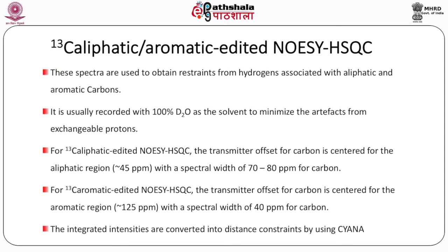Therefore, when you put D2O in the sample, you actually lyophilize the sample and rehydrate it with 100% D2O or 100% D2O buffer. Then what happens is that the amide NH get exchanged, and so they do not give any spurious peaks in the spectrum, so that the spectral width can be shortened and one can only look for the CH aliphatic region or the CH aliphatic to CH aromatic.